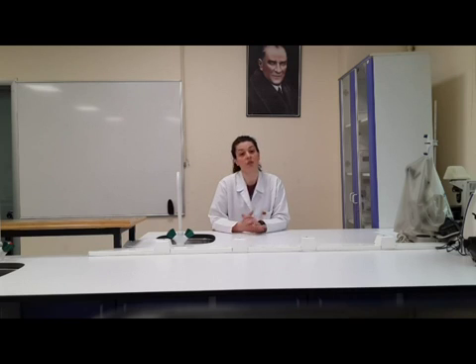In this experiment, efficiency depends on a few key controls and experimental conditions, such as control samples. This control serves three important purposes. First of all, it ensures that culture conditions used for all experimental samples are enough to support proliferation constantly in the absence of treatment. Also, this sample is needed as a positive control to be sure that BrdU and CD20 positive cells can be detected when they are present. And the last purpose of using this sample is to provide the calibration of the flow cytometer to have reasonable results for other samples to be analyzed.